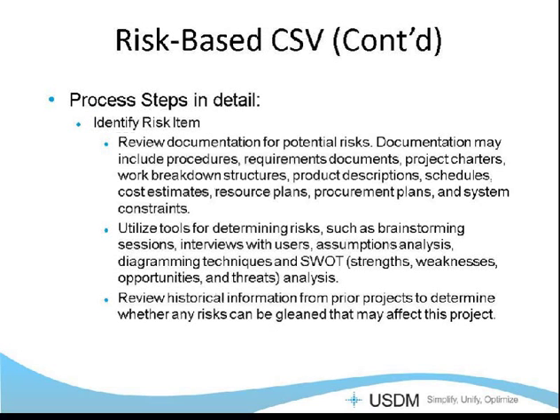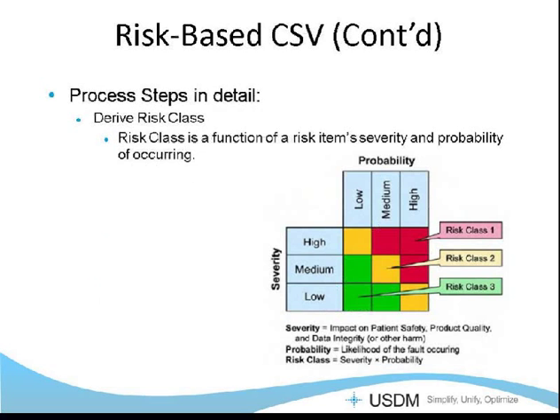When this webinar is posted, you can certainly read through the risk steps in detail. There's some more detail for how you assess risk. But what I wanted to wrap this up with was talking about the GAMP-5 methodology and just doing sort of a quick example of how you would assess a risk.